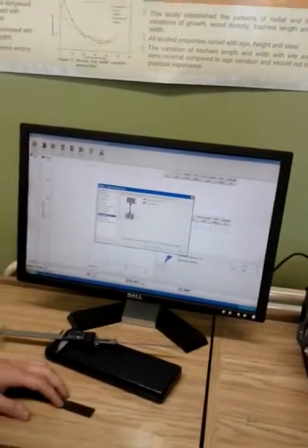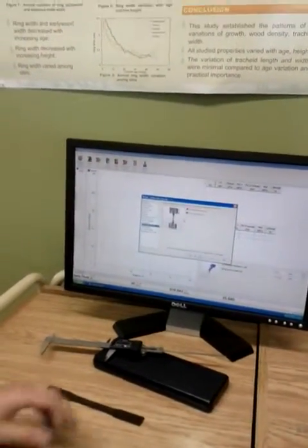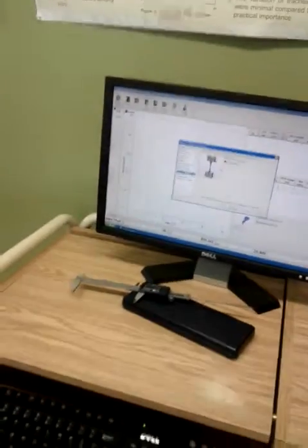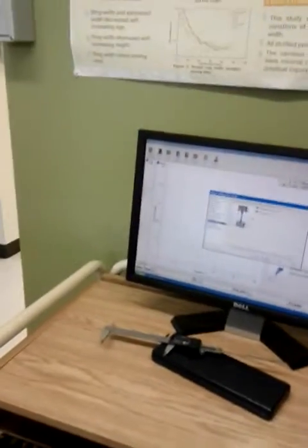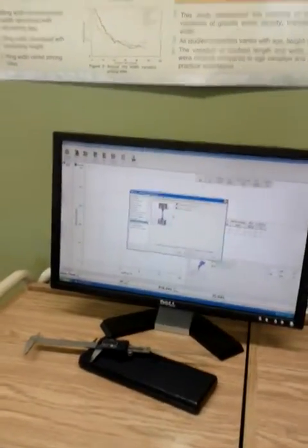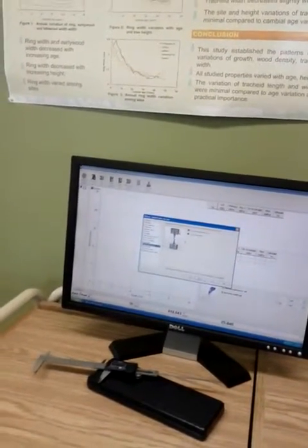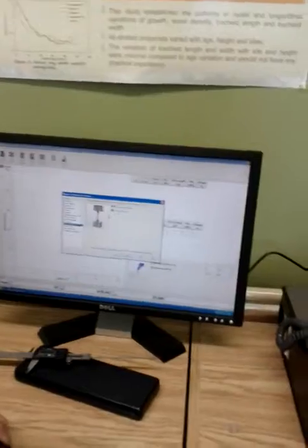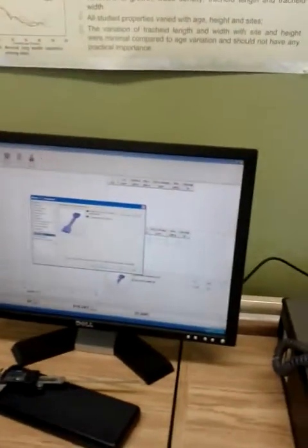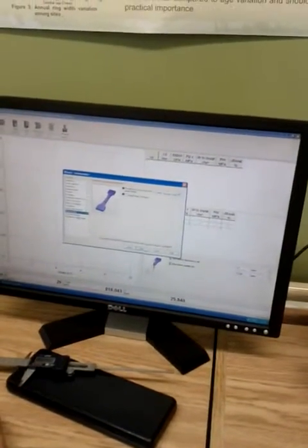After the test is finished, you can ask the machine to go back to its position. I don't do this because the tensile sample will have broken, and it will go back and force the pieces together. When you do bending, you can go back to the position automatically, and it doesn't matter. It's up to you. We don't have an extensometer, but we should. You see in the standard it's mandatory, but we don't have it yet.